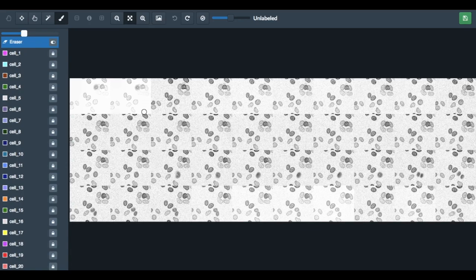Each panel is a snapshot in time, which progresses as you move from left to right and top to bottom. One thing to remember is that as these images are a progression through time, cells might change position between panels. Not only that, cells may also be moving into and out of the screen, resulting in an increase and then a decrease in clarity and intensity of the cells. Because of this, you're going to have to keep track of which cells are which.